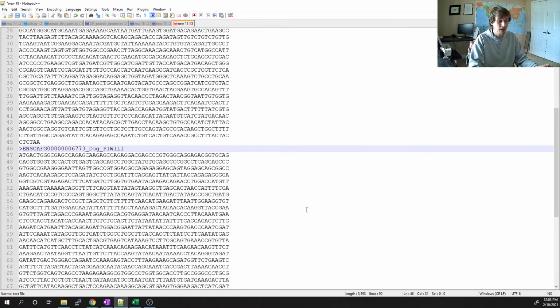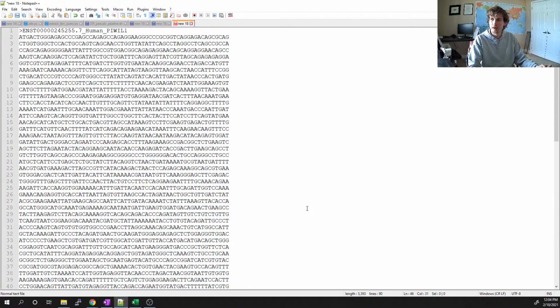We'll gather some other sequences later, but just to go over some basic concepts about DNA analyses, I'm just going to use these two sequences first. And I'm also going to introduce MEGA as well.